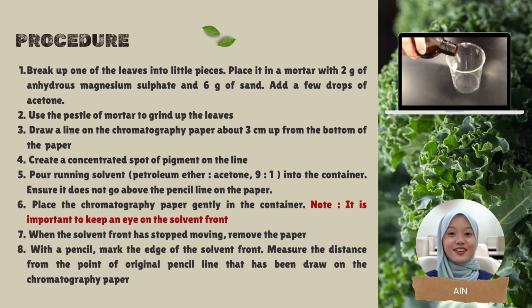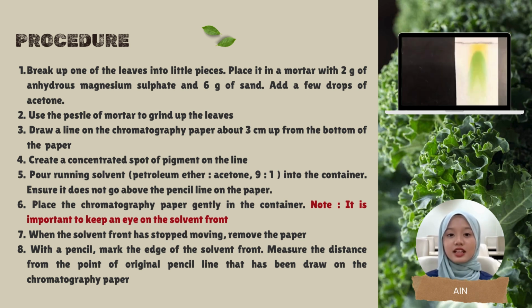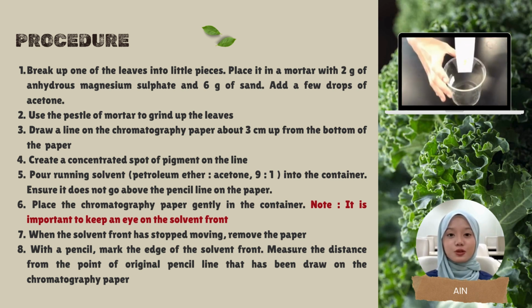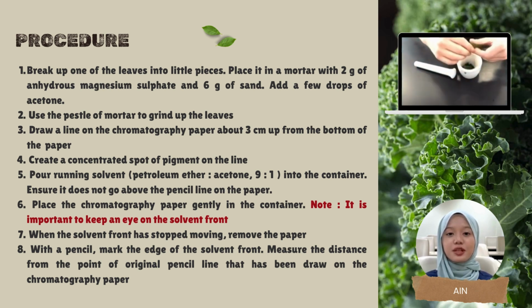This is a note for you. It is important to keep an eye on the solvent front, because the pigments will stop at different distances relative to how far the solvent front goes. Seventh, when the solvent front has stopped moving, remove the paper.